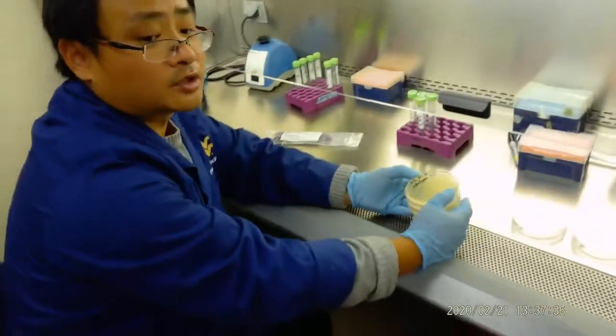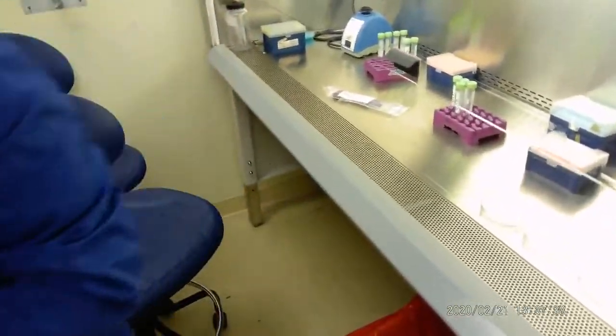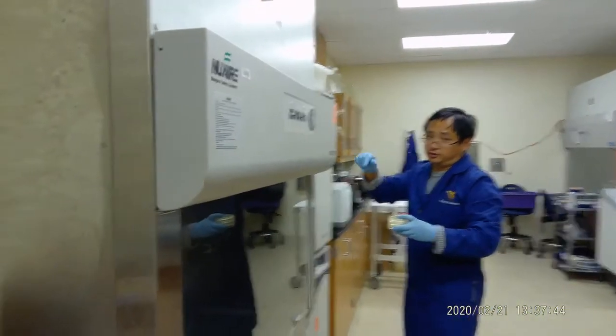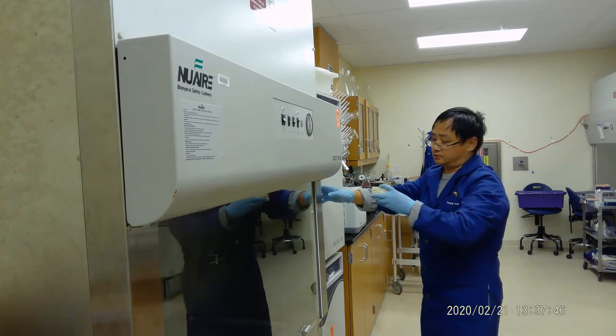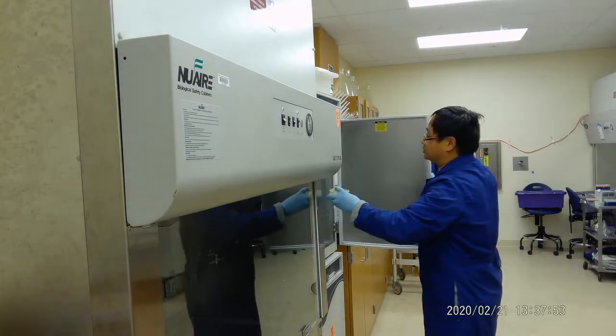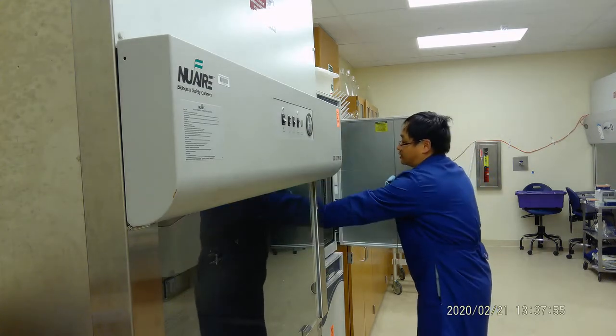So let's say in my lab we have an incubator right here. So we put it into the incubator, which is at 35. So we can take a picture of the incubator. Okay, take a picture a little bit closer of the incubator. So we put it into the incubator, then right here.